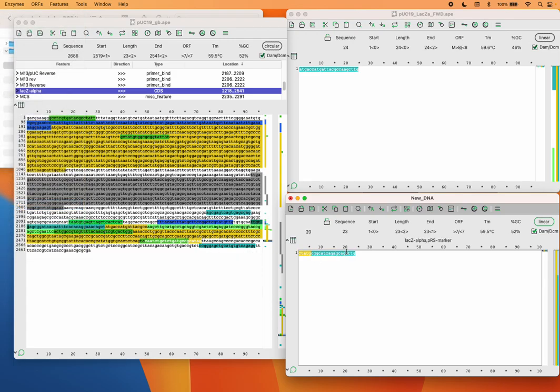So now this sequence is changed so that it's no longer this highlighted sequence, but it's the reverse complement of this sequence, which basically means you'll see here we've got CTAT, which will bind to this GATA. Okay, so you'll see that this is actually binding to the opposite strand and going this way, pointing backwards towards the 5' end here, so the forward primer.